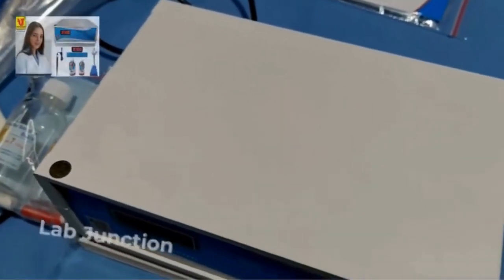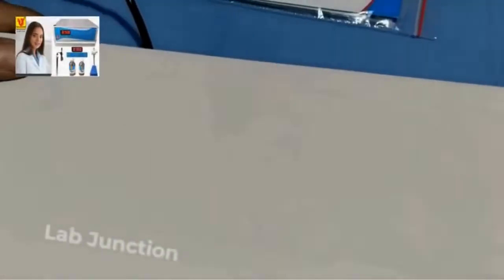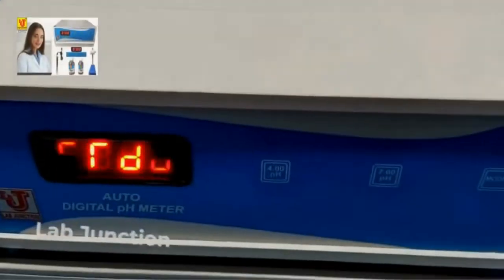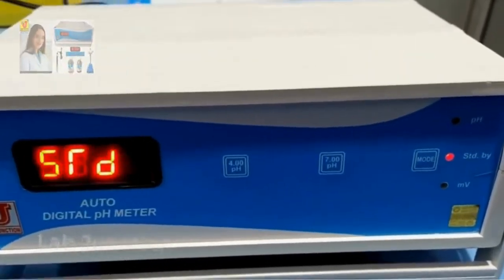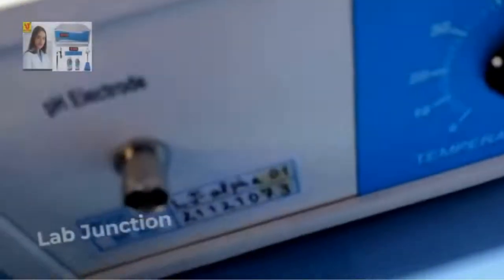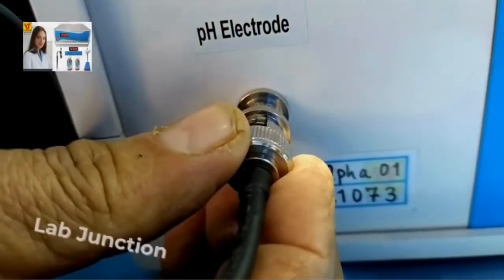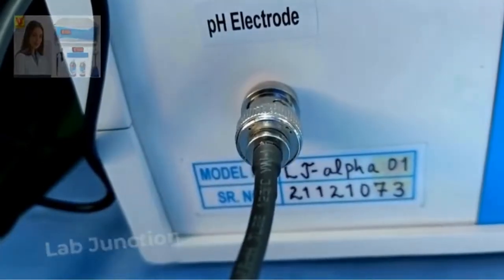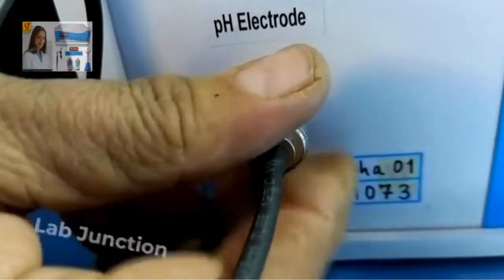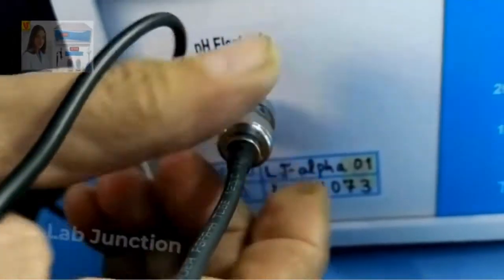Now, how to calibrate this instrument. First, I have switched on from the back side of the instrument and the display starts. Now I am connecting the epoxy body pH combination electrode to the instrument. Just push and twist to connect it — push and twist like this. This is now locked.